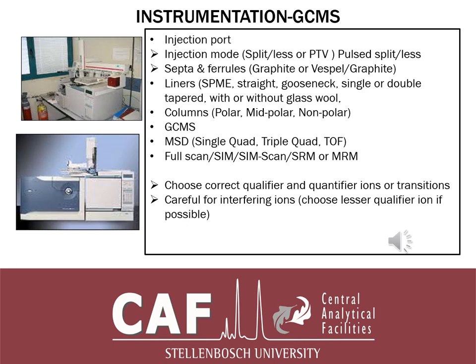Now, next we come to the instrumentation part. The GCMS chromatograph consists of the injection port, the GC column, and the detection part. For the injection port, one will talk about the injection mode, where you talk of split or splitless injection or PTV, programmed temperature vaporizer, and also the type of splitless injection can be pulsed split or splitless, and some manufacturers call it, if I'm not wrong, pressure surge.